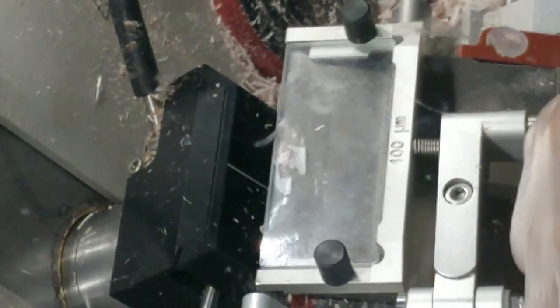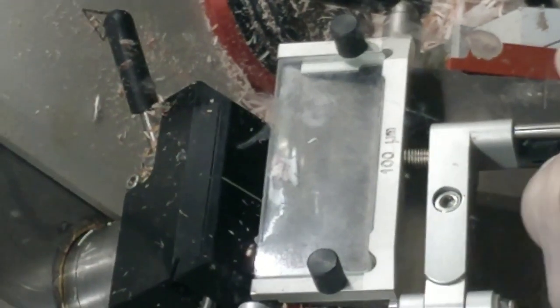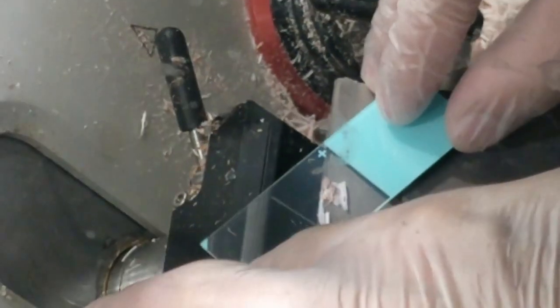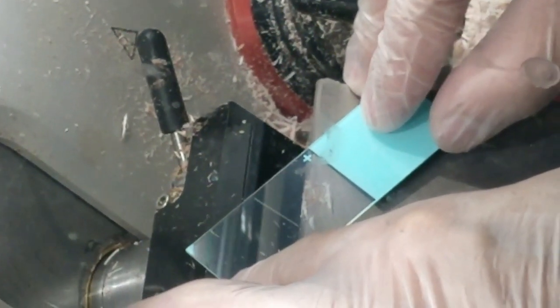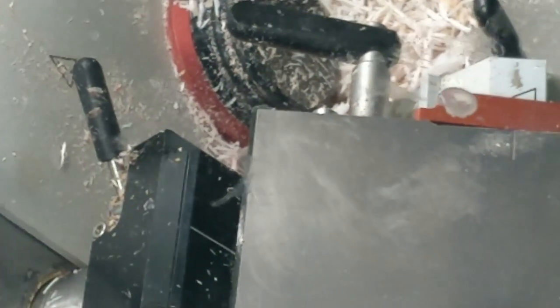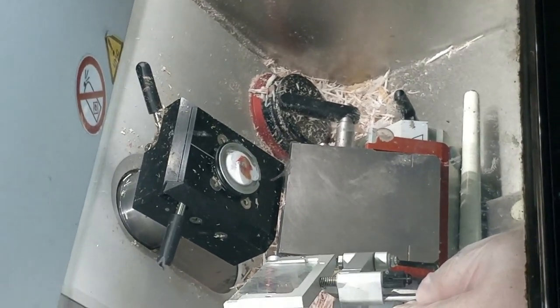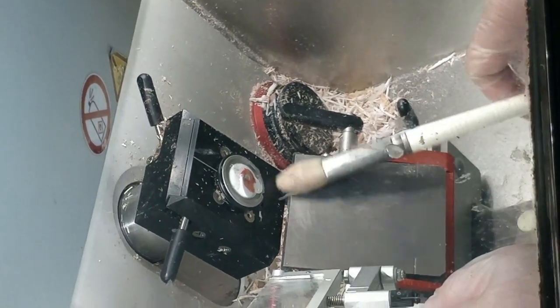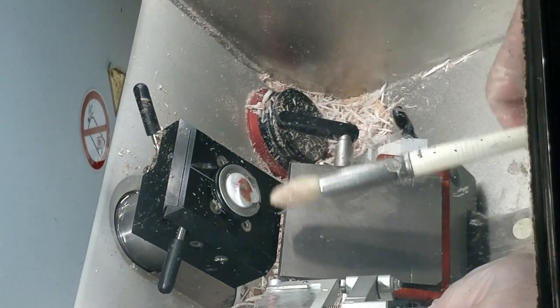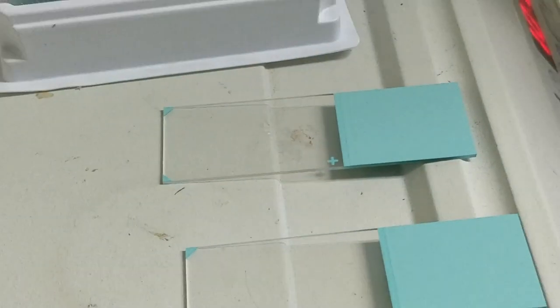So versus our traditional formalin-fixed H&E slides, no. Ours is the frozen section. Well, of course, it gives the diagnosis, but rapid diagnosis is not its purpose. The purpose of frozen section is to change the course of the management, no? So, I'll talk about this more in the lecture. So, we've placed it on the slide.